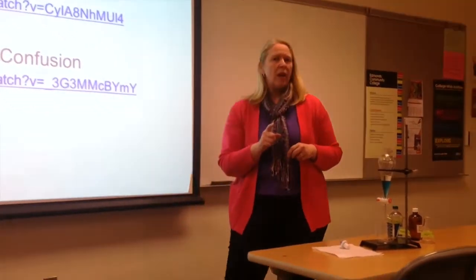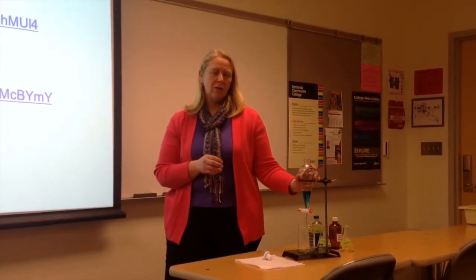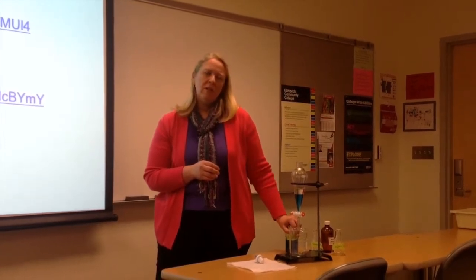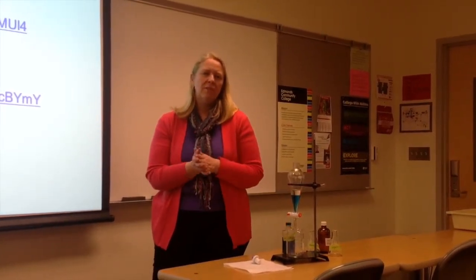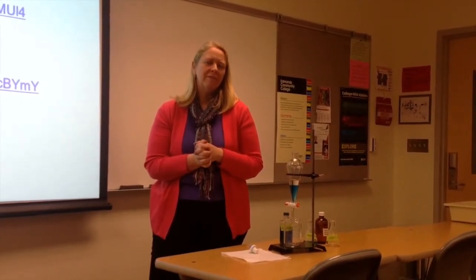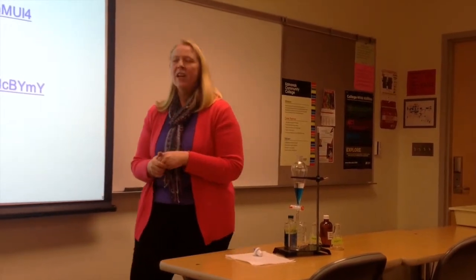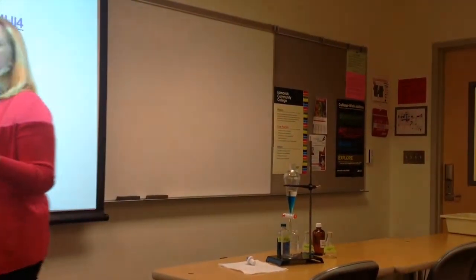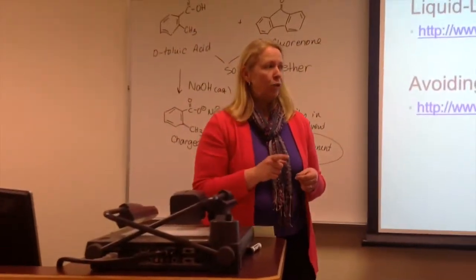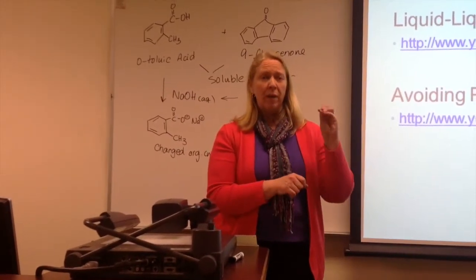One of the questions I do have for you is, do you think it's good to just do one extraction with a lot of sodium hydroxide, or do you think it might be better to do several smaller extractions? I would think it would be better to do several smaller extractions because you have more chance for the molecules to interface that way. And that is exactly right. Although you might think, hey, I'll just use a lot of solvent and then I can get that all transferred. That is actually not true. Typically, you want to do about 2 to 3 extractions with smaller amounts of solvent.